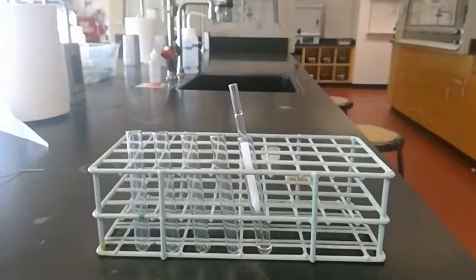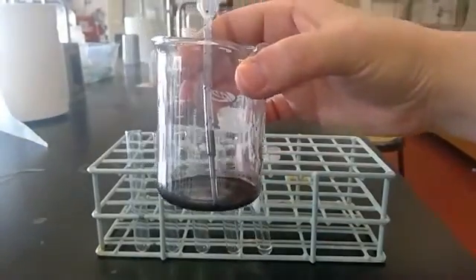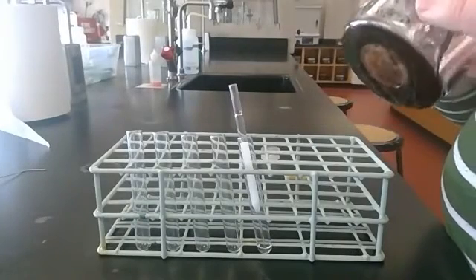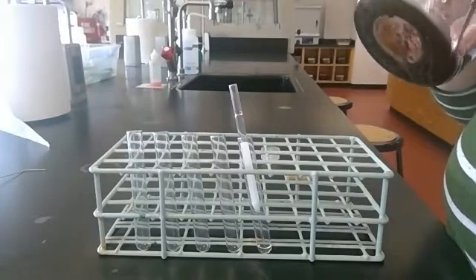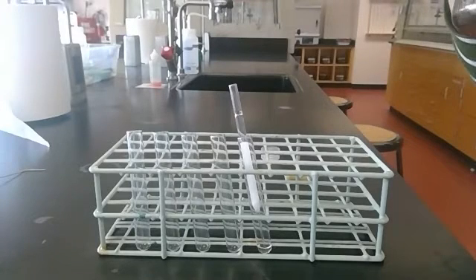And so what I have is a very concentrated solution of grape Kool-Aid mix with just a touch of water. And I wanted this to be as concentrated as possible because I'd like to get away with just using a couple drops of this.